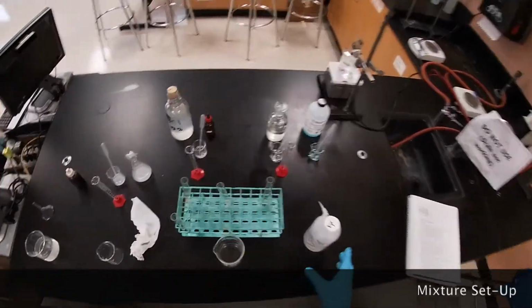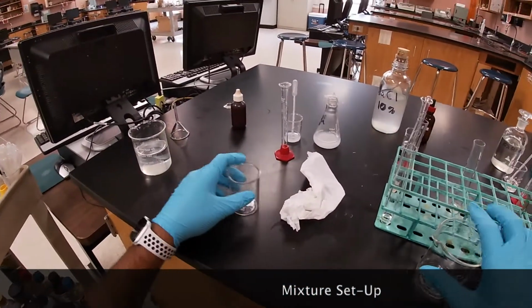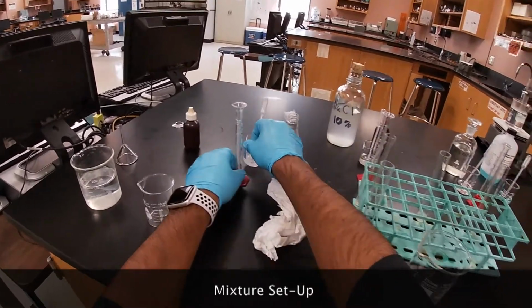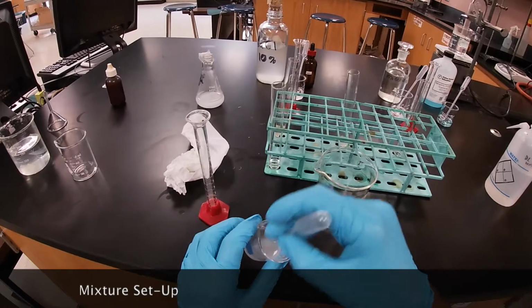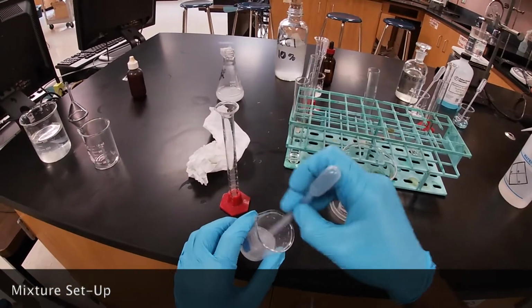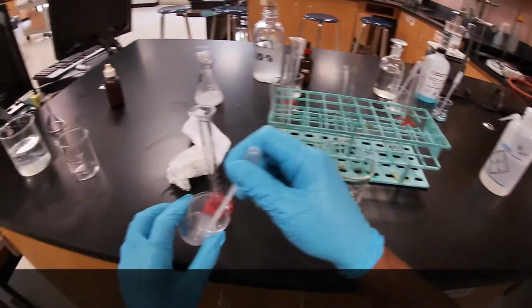Okay, so we're gonna measure out our 10 milliliters of each solution. We're gonna start off with the starch. I'm just gonna go ahead and mix and measure our 10 milliliter solution.